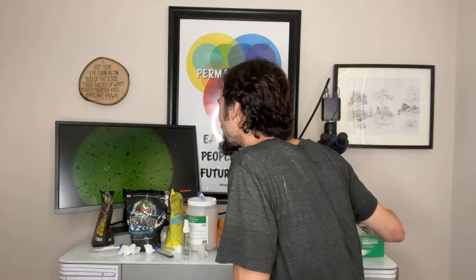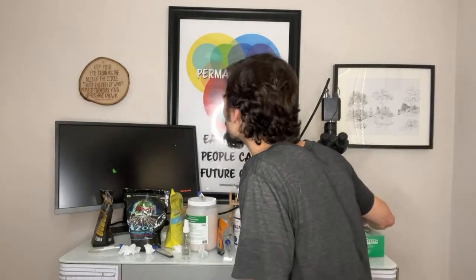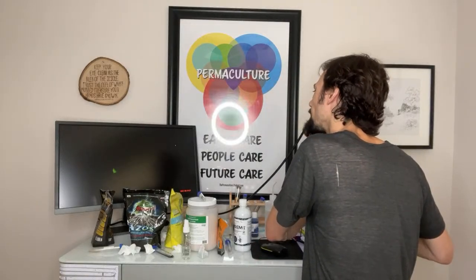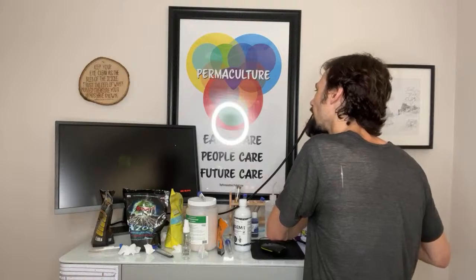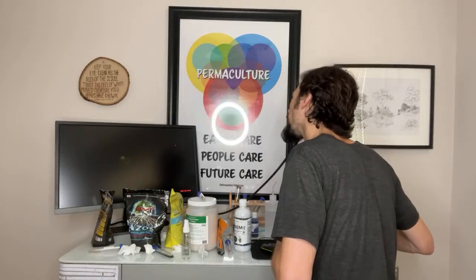Okay. I found something. Here we go. It's got a halo around it. This could be good. Oh, it's just so tiny. Let me let in some more of the light. The question is, I can kind of miss things. All right, I'm closing the light all the way. Yeah, that right there looks like a crystal, a very large one.